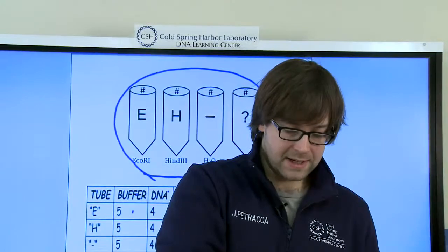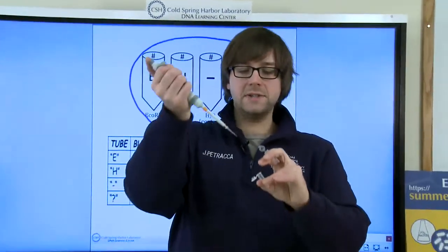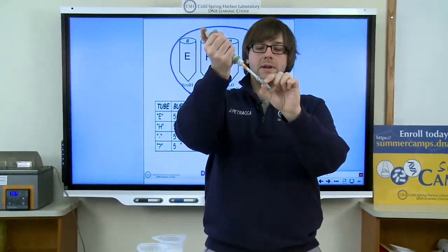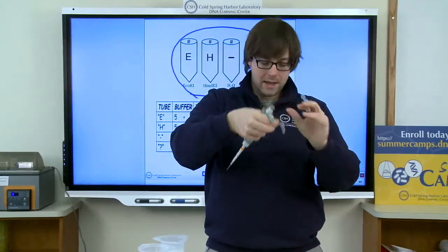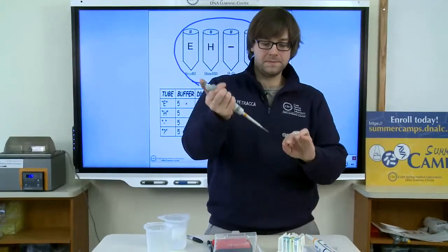Okay, and then I'll repeat the process. I'm going to repeat the process for my minus tube as well. So I go to the first stop, take up the solution, go down to the bottom, and I finally finish off with my question mark tube.